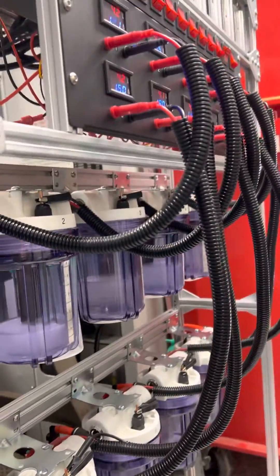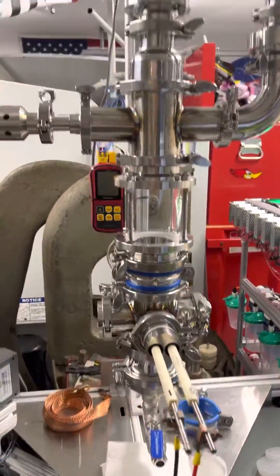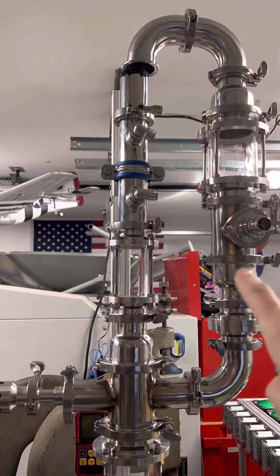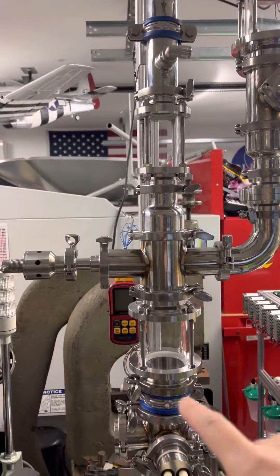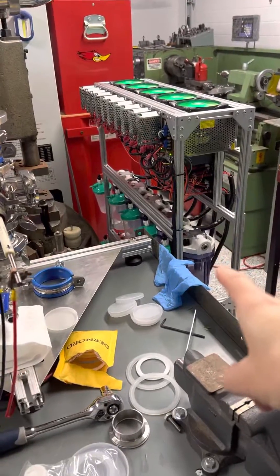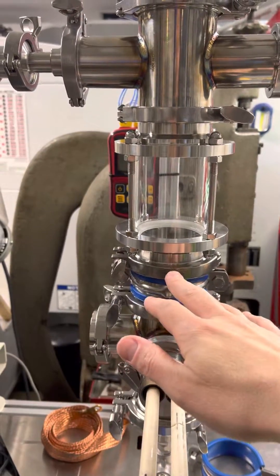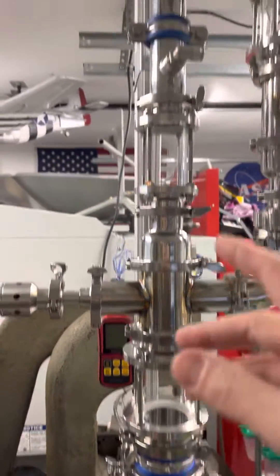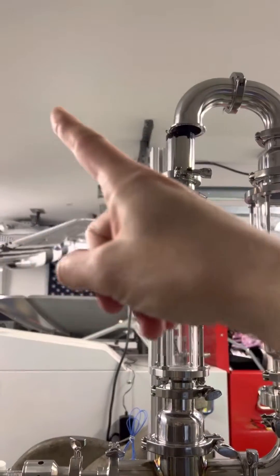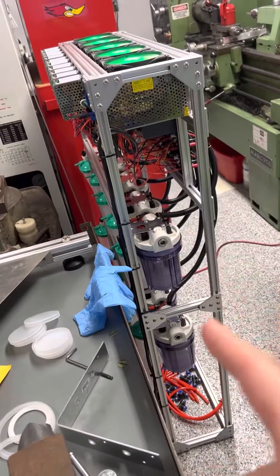I've got all these cells going, so that's been chugging away for about three weeks now. I made a change here — I added this whole loop up here. Basically it's a closed loop, so it'll contain all of the heavy water that goes down in this part and gets heated and bubbled up. I used to vent it to the outside, to the room — it used to just go straight out and I would end up losing a whole bunch.